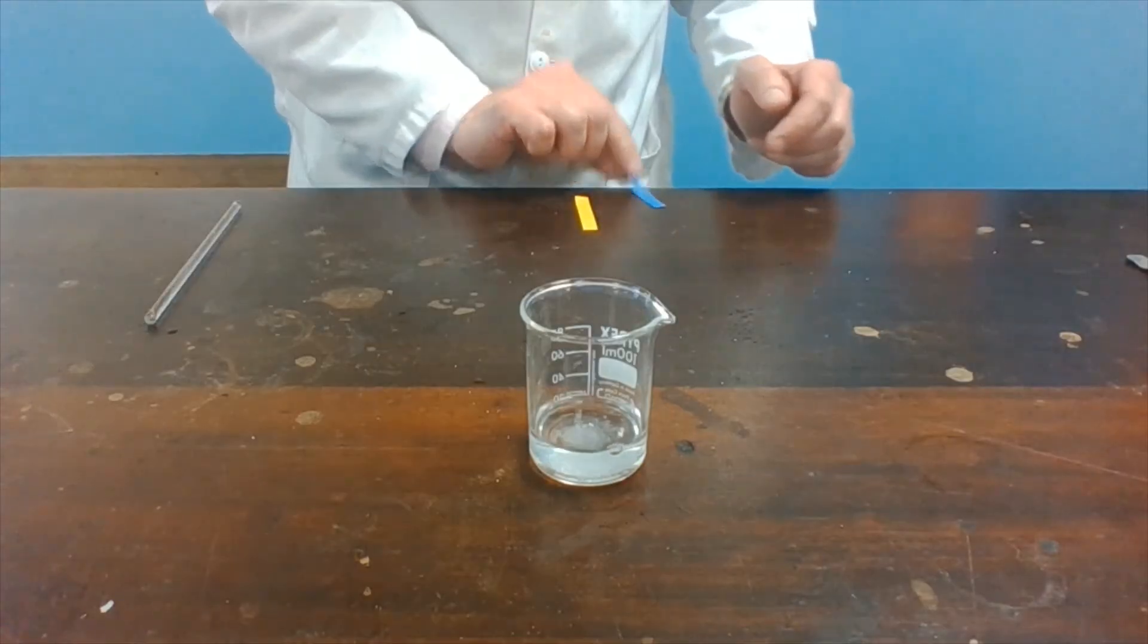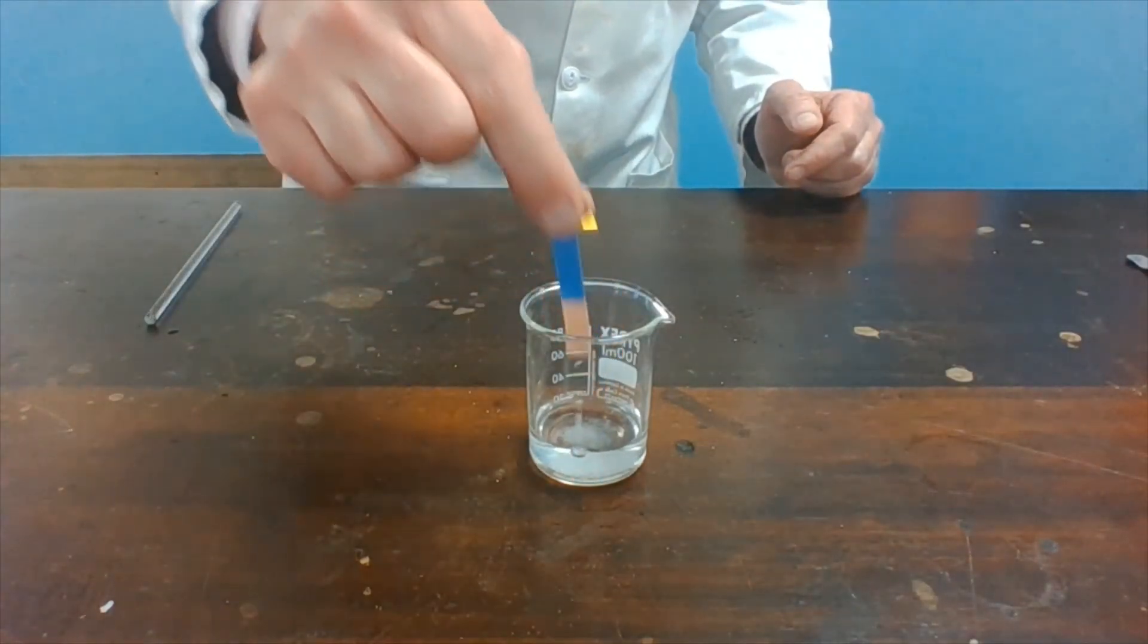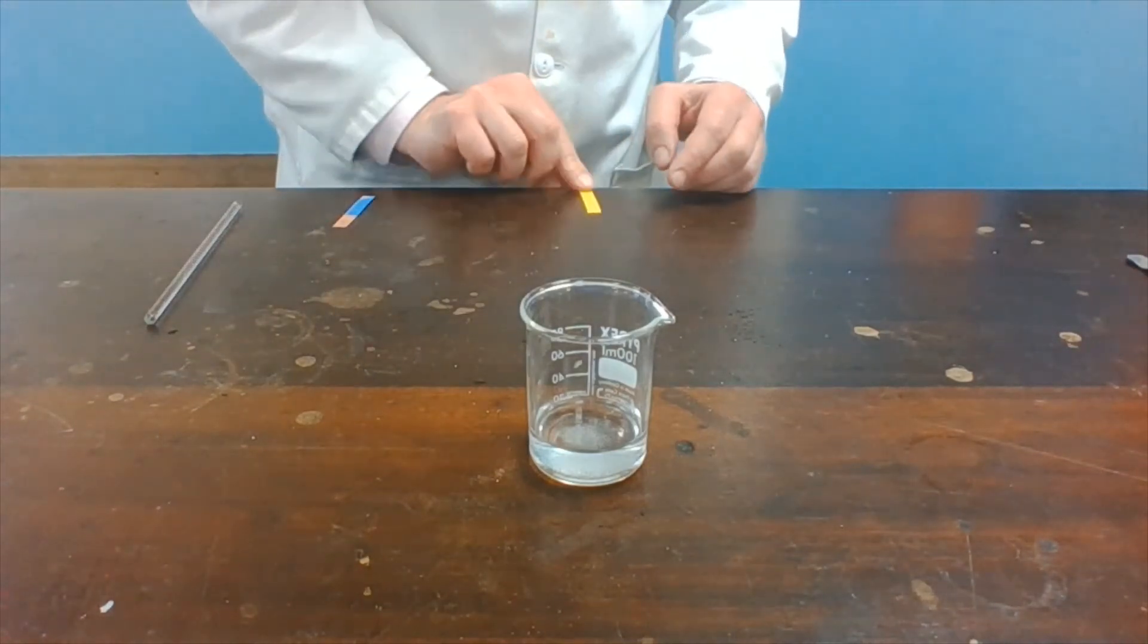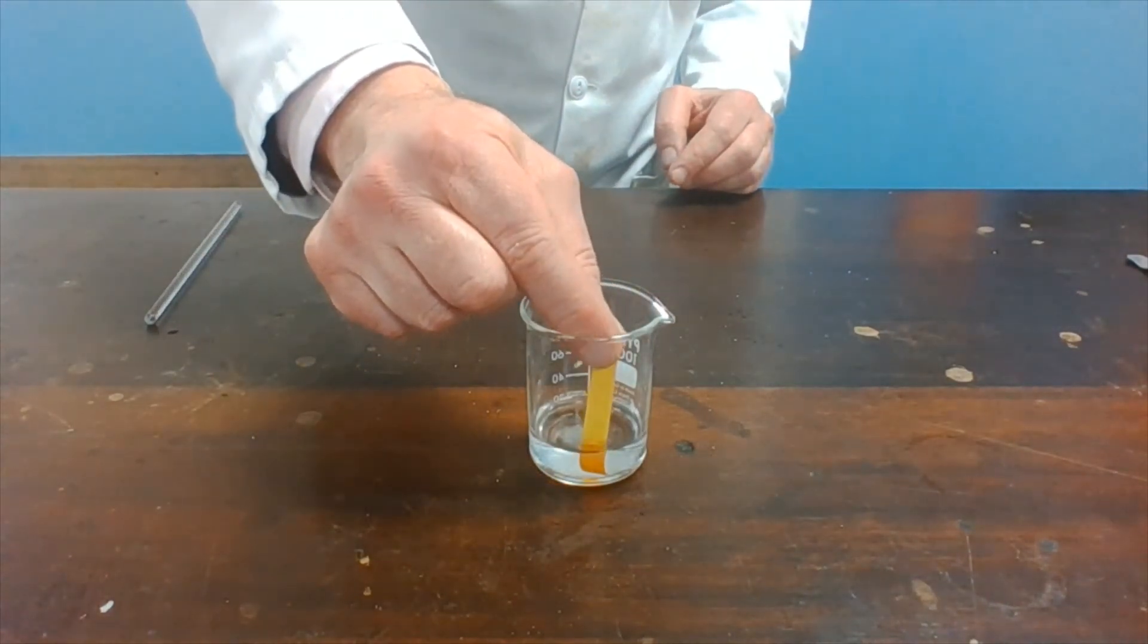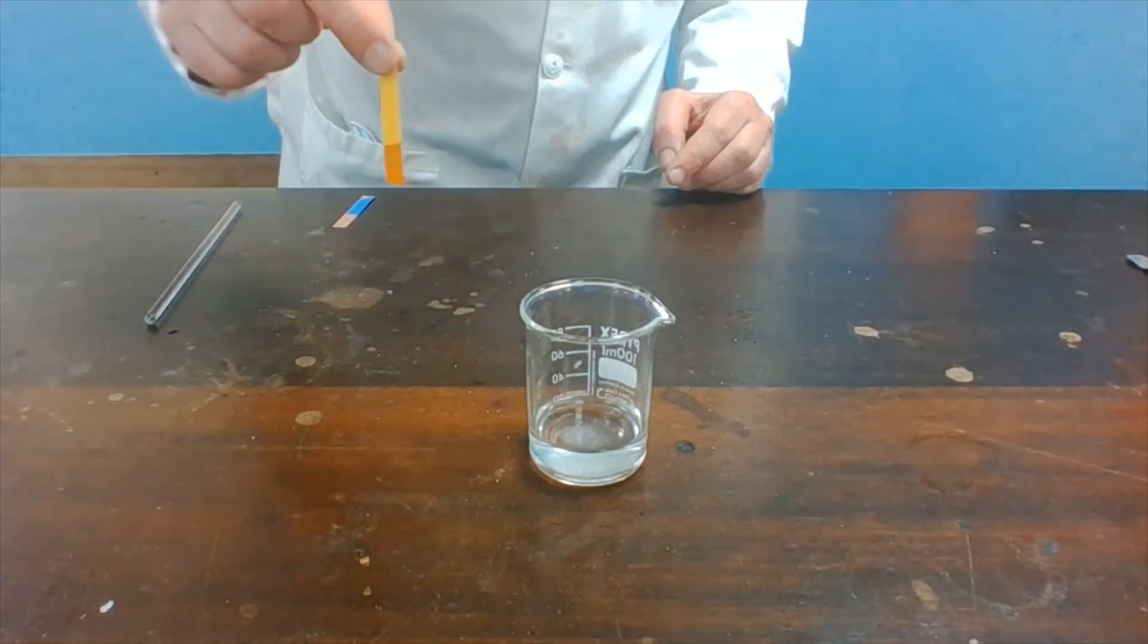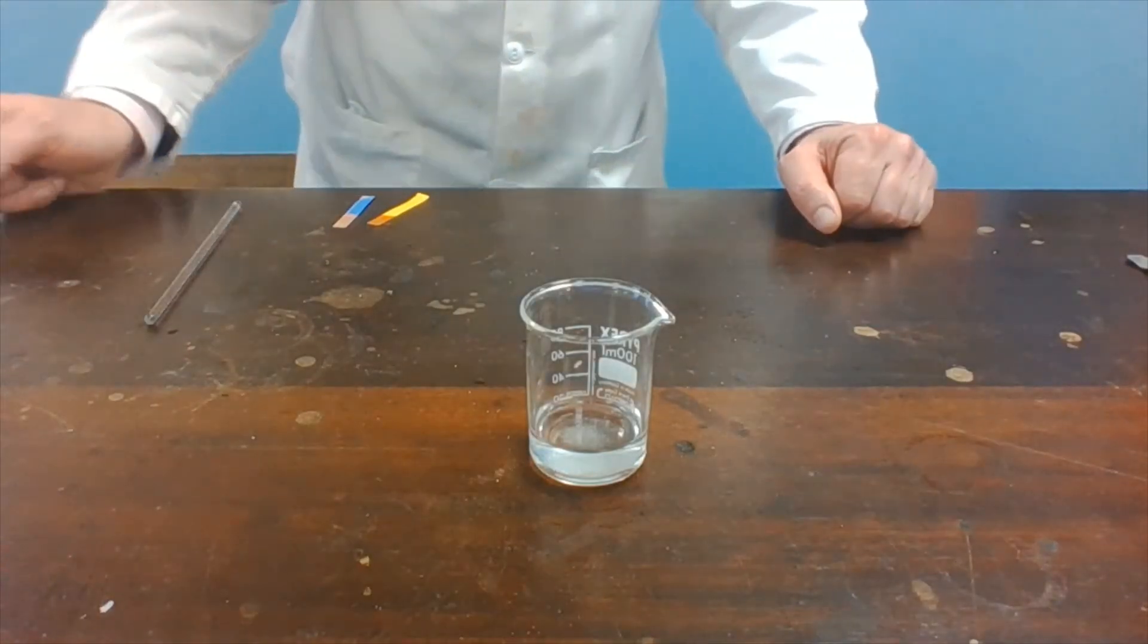And then test it with the indicator paper. You will see that the blue litmus paper turns red. And the universal paper turns orange. So the solution is now acidic.